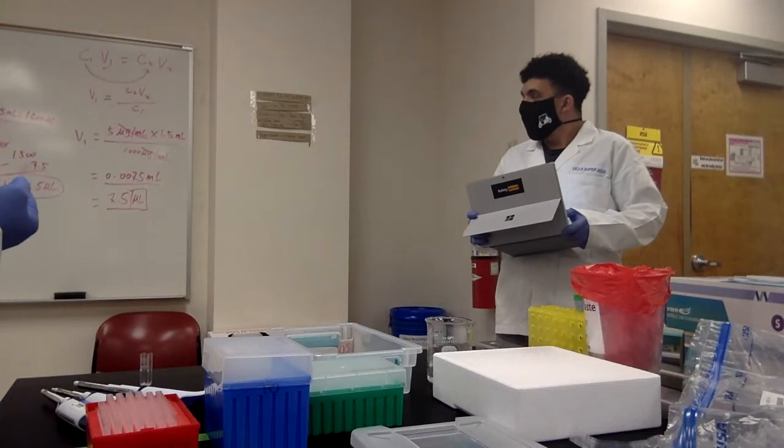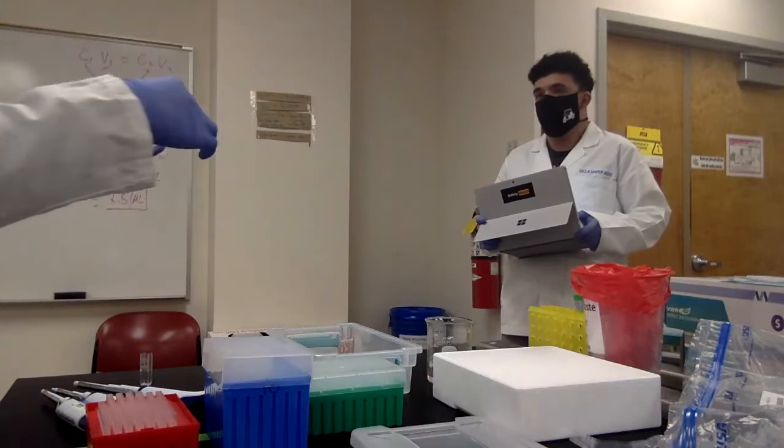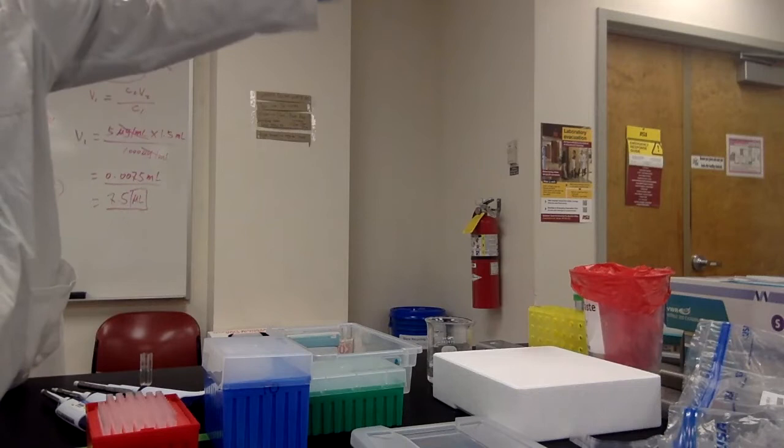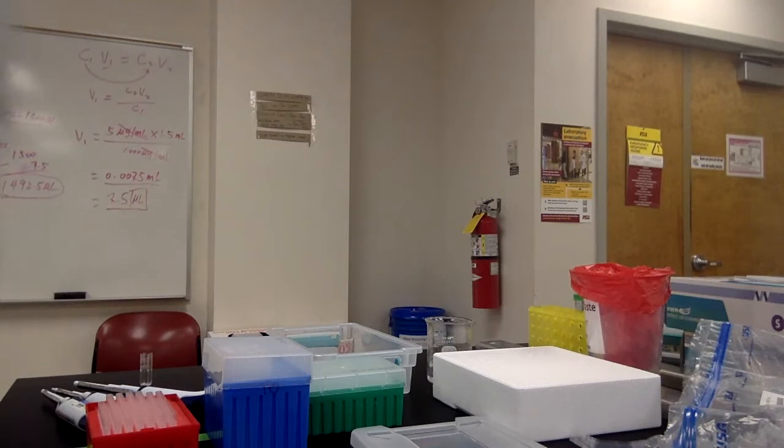After that, you transfer that solution from the tube into the cuvette. Make sure you get all this ready, and I will bring you to the spectrometer to measure the absorbance. So you want me to calculate the dilutions and total volume first, correct? Yes.